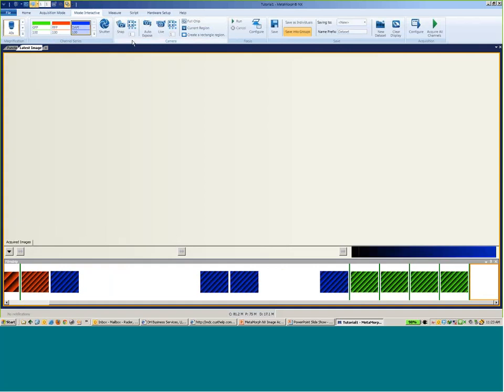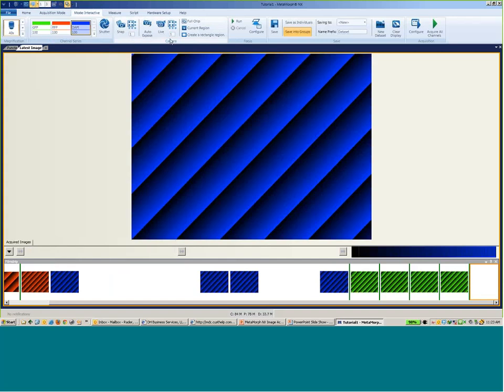So if I hit acquire, it's going to start the acquisition, and I can easily see the acquisition as it's going along from the latest image tab. One of the things that I didn't point out last week as far as your displays: these tabs you can easily click back and forth between, but if you left mouse click on a tab and drag it to the center, you can reposition your views. So now I have just the normal data sets on this side and the current acquisition I've got going on split over here on this side.